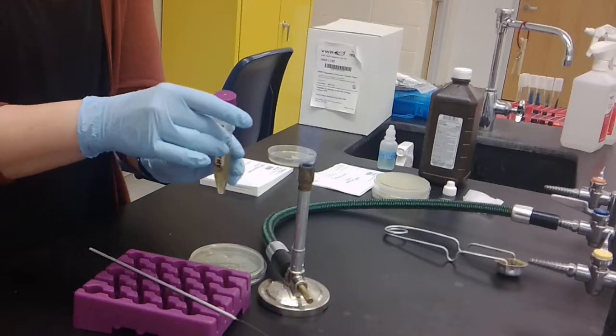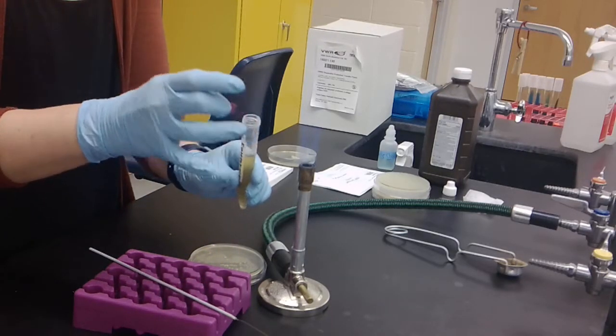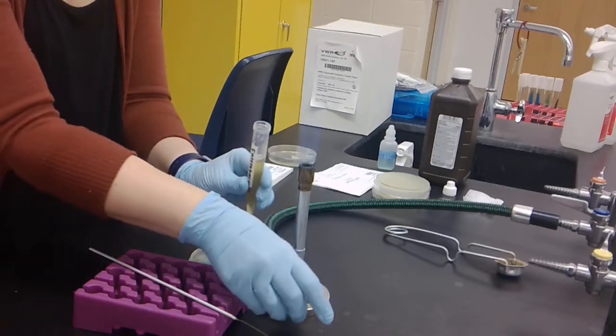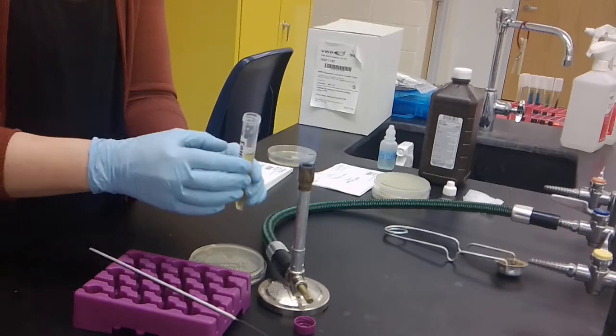Then you want to take your broth culture, open the lid, and either hold the lid in your hands or place it on the table with the cap opening underneath the Bunsen burner flame.